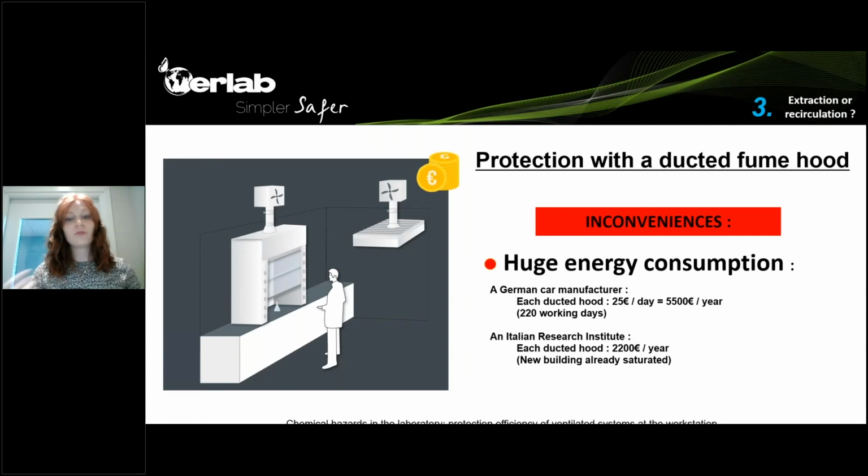For instance, there is a study that has been made on a German car manufacturer that is using ducted fume hoods, and considering 220 working days, the consumption of the ducted fume hoods was around 5,500 euros per year.